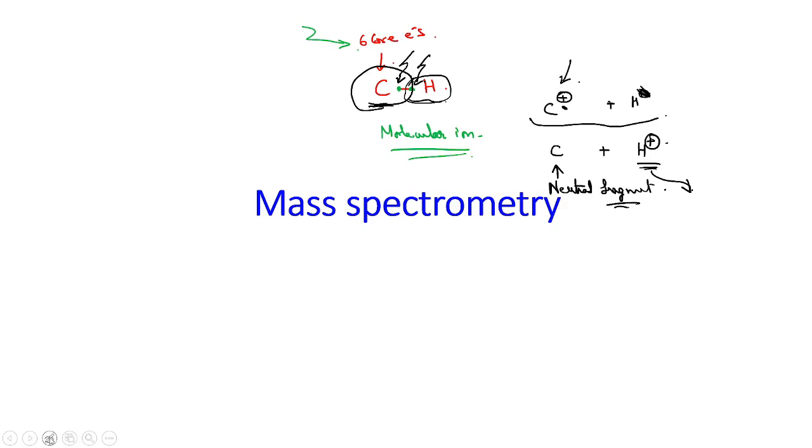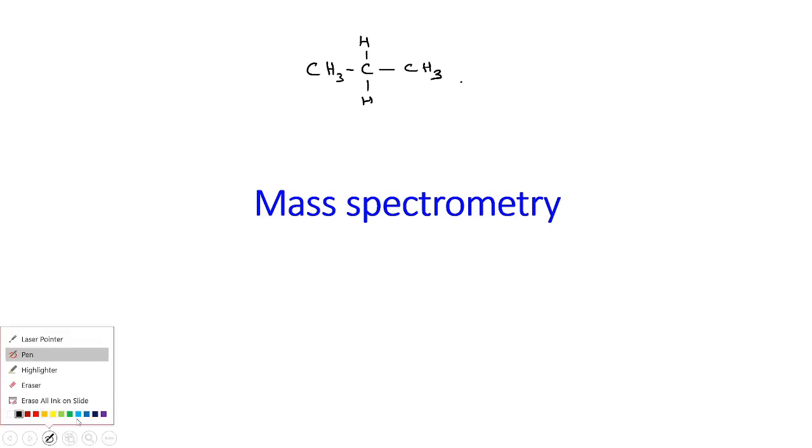Now let us take the example of propane. What might happen when you are bombarding it with electrons?